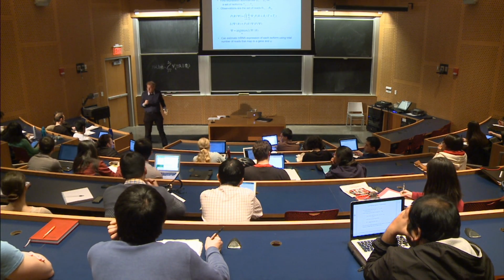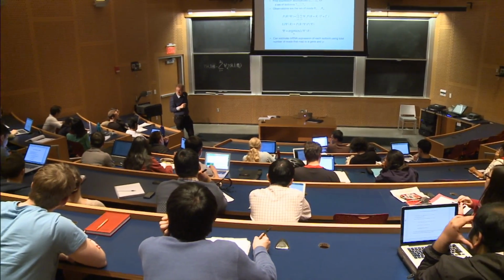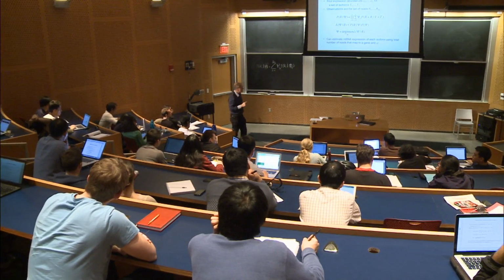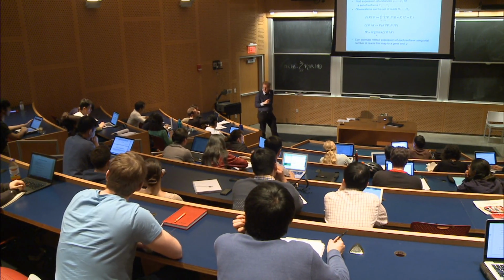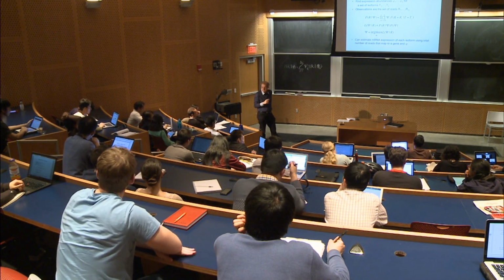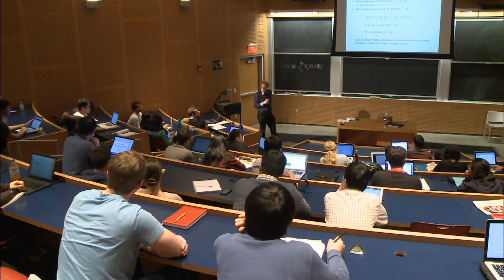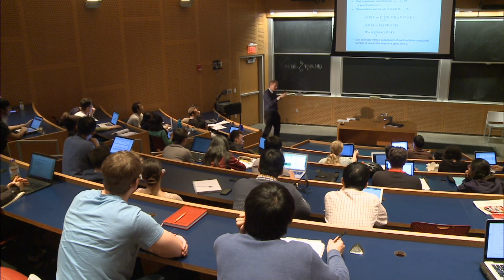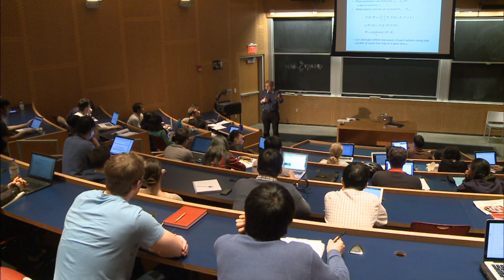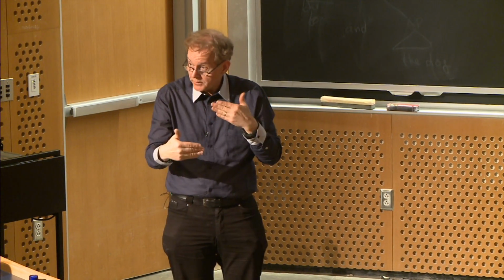Yes? I'm a little lost in the last couple of slides where you're describing these 3 cases for excluded, single, and paired reads. Right. So we're calculating the different probabilities for both ends to happen in the transcript, or for just one. It depends. The second and third cases depend on whether we're analyzing single-end reads or paired-end reads. And so we wouldn't use both of them at the same time.